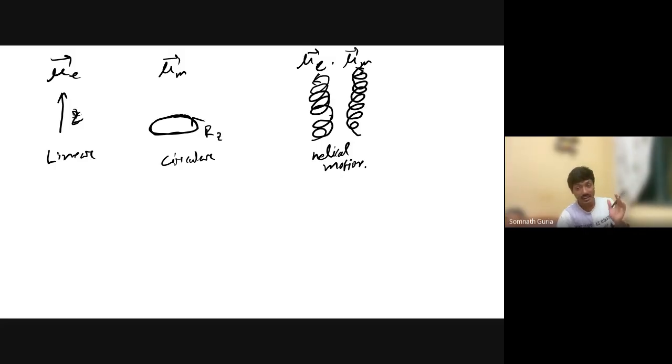So these things interact with each other, and one particular circularly polarized light slows down in speed, while the other goes through as it is. If it is slowing down, then it shows optical rotation. If it is absorbing, then it will show my circular dichroism, that is, the ellipticity will be found.